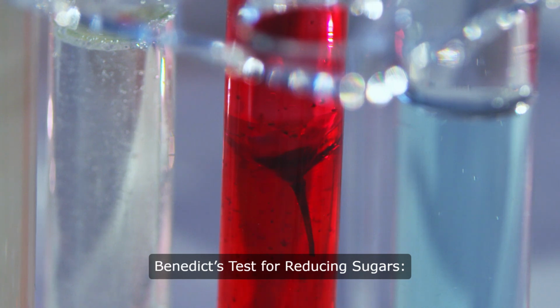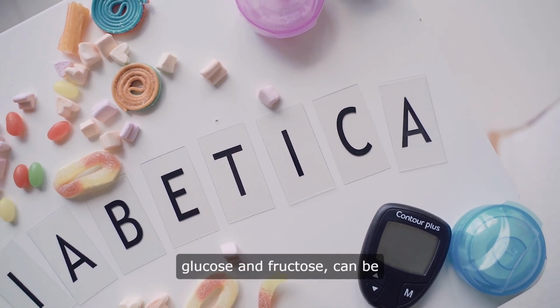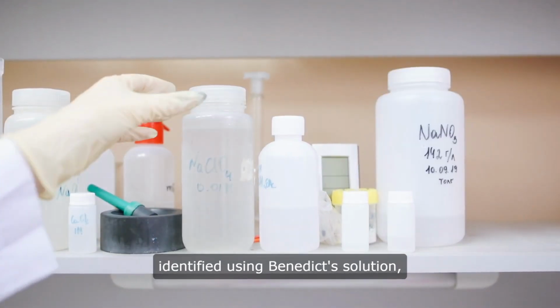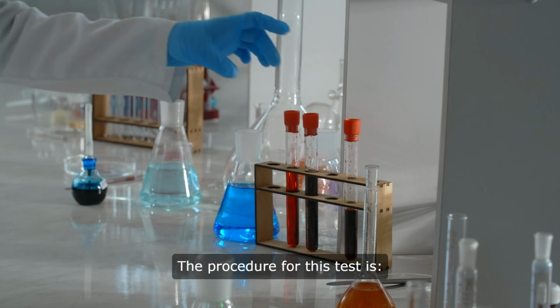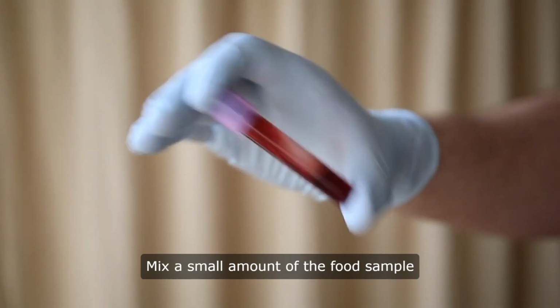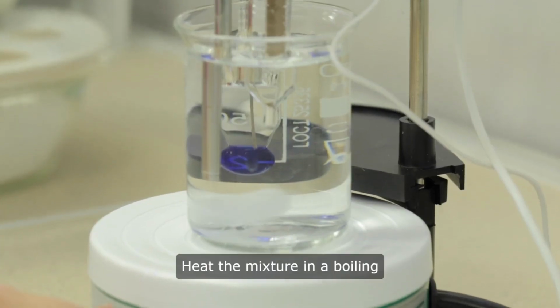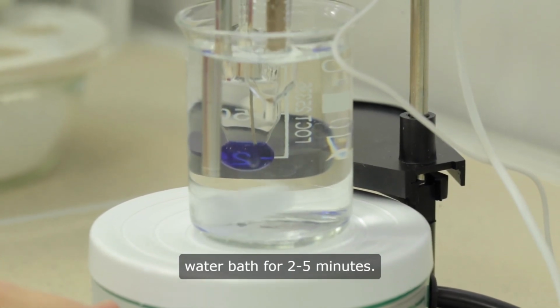Benedict's test for reducing sugars. Reducing sugars, such as glucose and fructose, can be identified using Benedict's solution, a blue copper sulfate reagent. The procedure for this test is: 1. Mix a small amount of the food sample with Benedict's solution in a test tube. 2. Heat the mixture in a boiling water bath for 2 to 5 minutes.